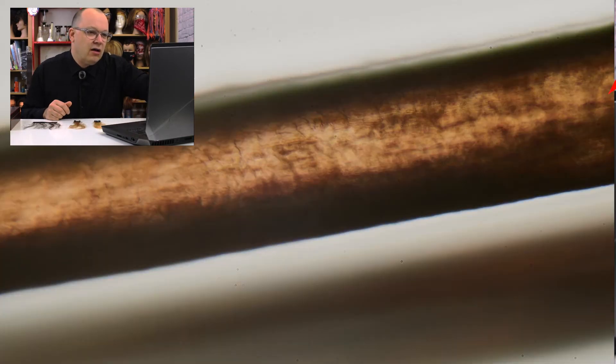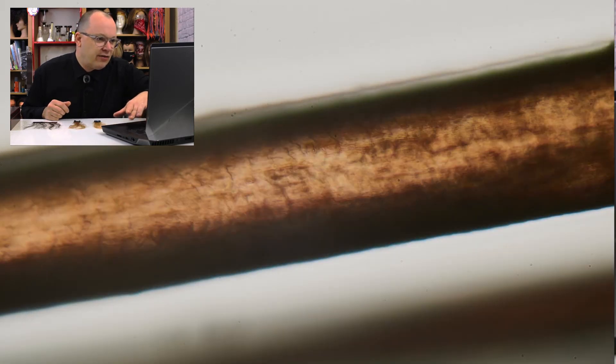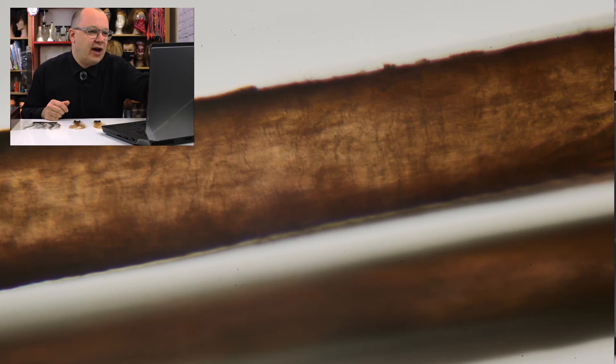You can see up on the outer edges here the individual cuticle layers — they're already a little bit raised, but they're not going to be perfectly flat. You can see right in the center of the strand where it's brightest those individual cuticle layers, which are see-through. So what we're doing is seeing through those into the pigment of the hair, which is contained in the cortex. Here's another view where you can see the side profile and those little ridges where the cuticle is already raised a little — which is pretty normal.